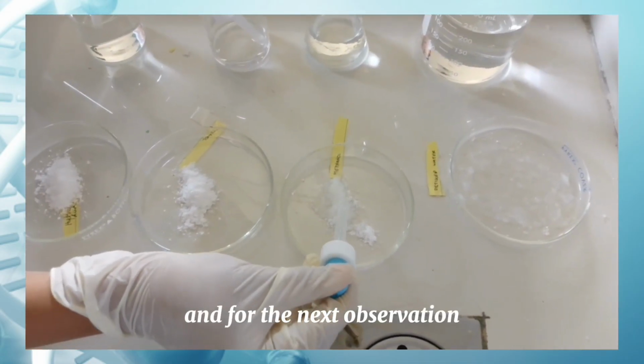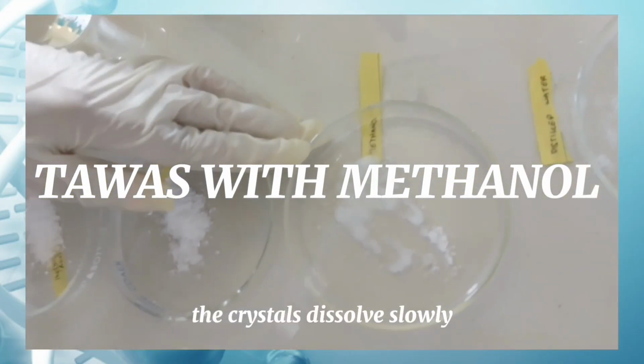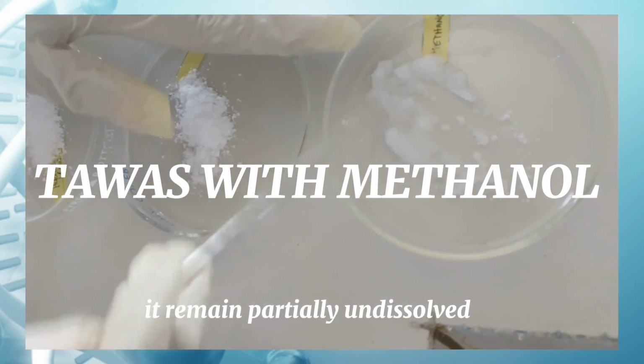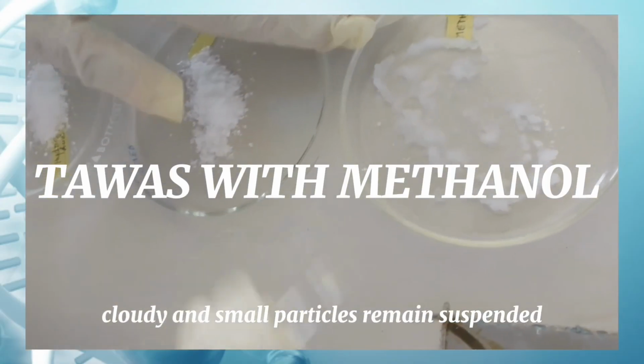And for the next observation, tawas with methanol. When tawas crystals are mixed with methanol, the crystals dissolve slowly or remain partially undissolved. The mixture may appear slightly cloudy if small particles remain suspended.